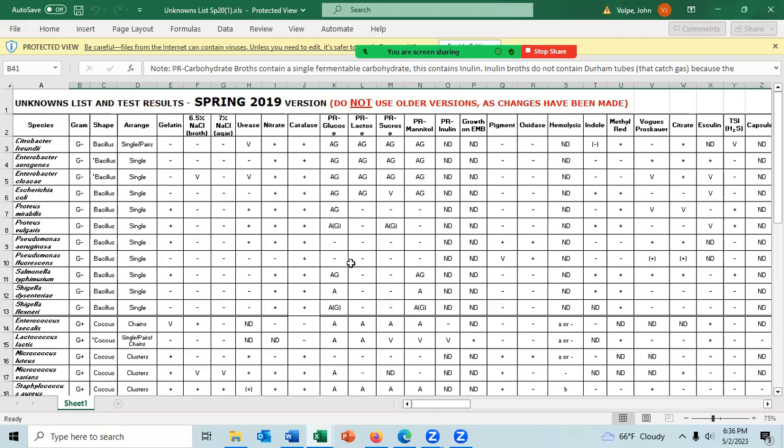Now, initially, I'm going to pick the number of tests that you will do, and I will start the gelatin hydrolysis test. If everything goes well, I'll actually start it tonight. If it doesn't go well, I'll start it whenever I email you the number.